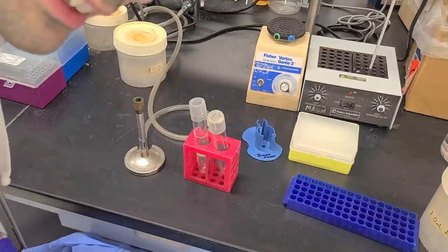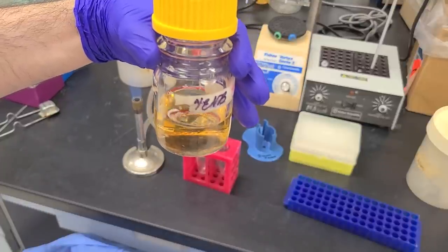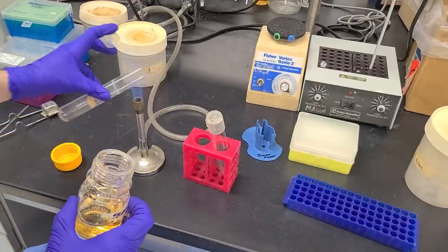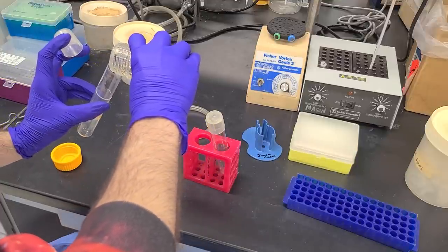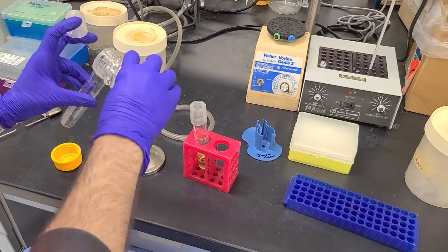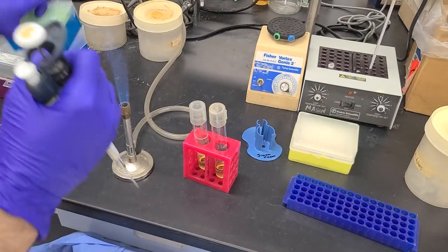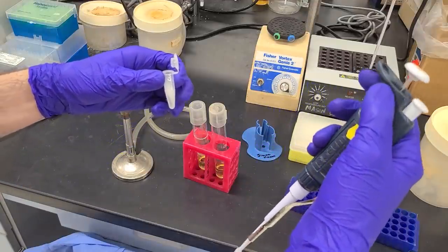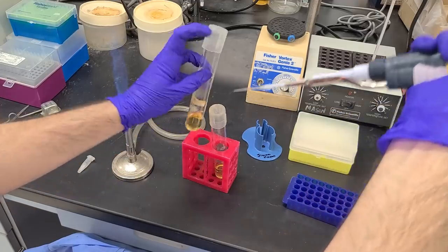Let's grow some bacteria. Delicious yeast soup. So this is bacterial growth media. I'm going to be sterilizing these tubes with this flame and then adding in this bacterial growth media. Next, I'm going to add a little bit of the antibiotic kanamycin because I only want the bacteria that are resistant to kanamycin to grow.